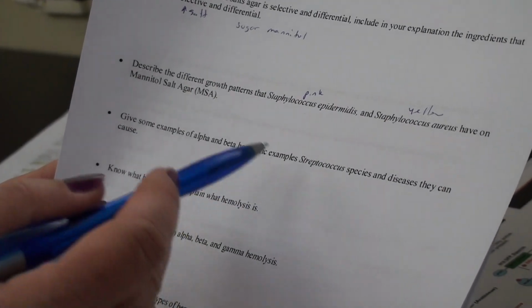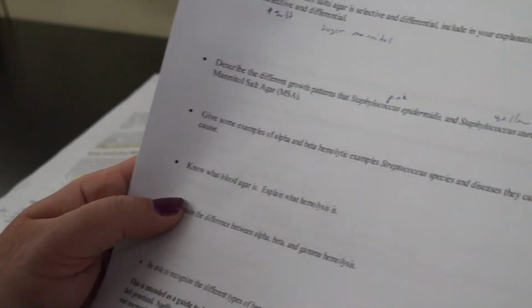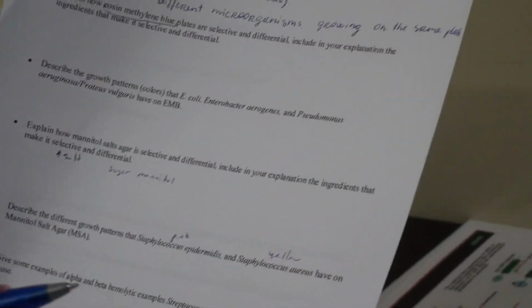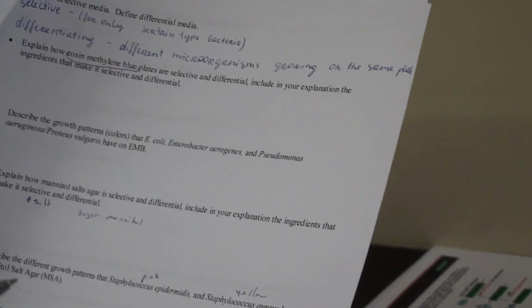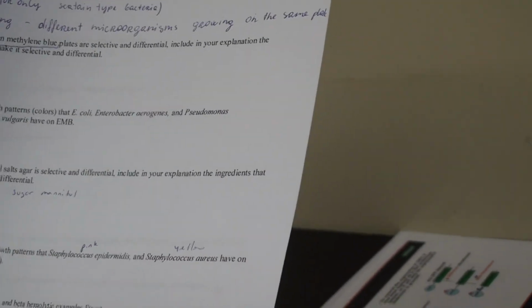Next, we're going to talk about how bacteria grow on blood agar plates. So we have blood agar plates that I purchased from a company. We don't use human blood. We have to use sheep blood. And basically, the breakdown of blood cells is called hemolysis. And there are 3 different types of hemolysis.